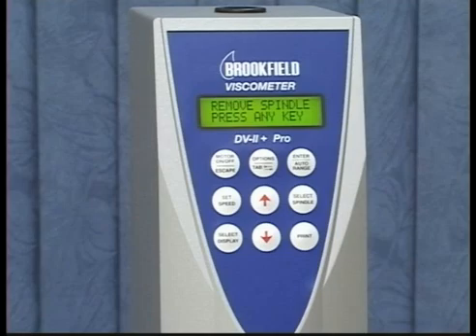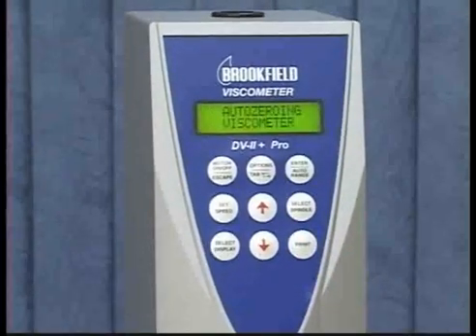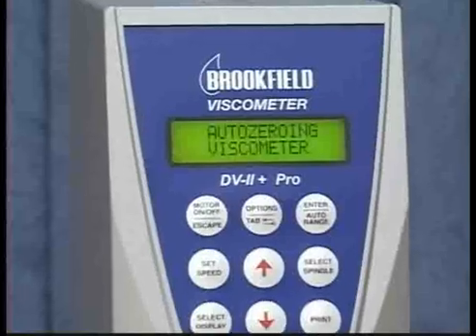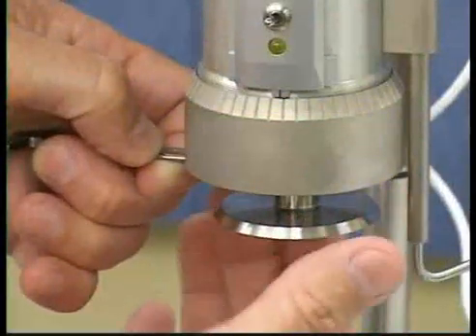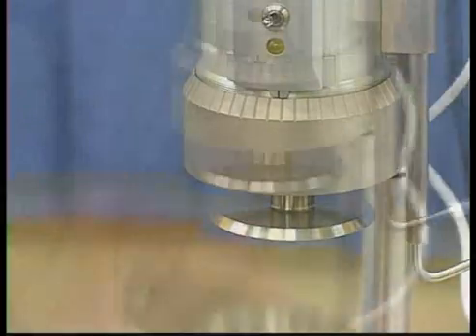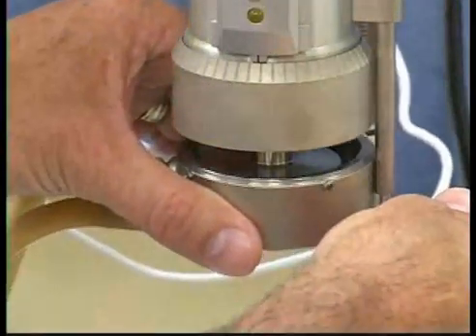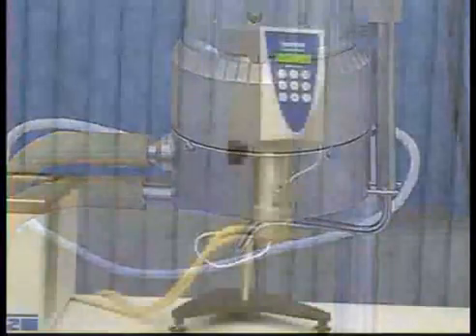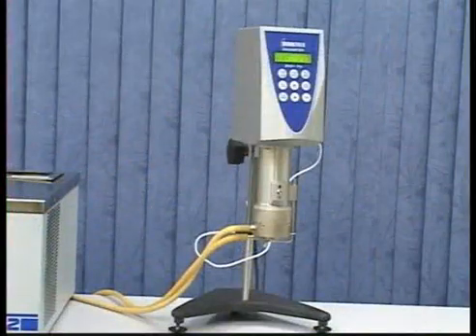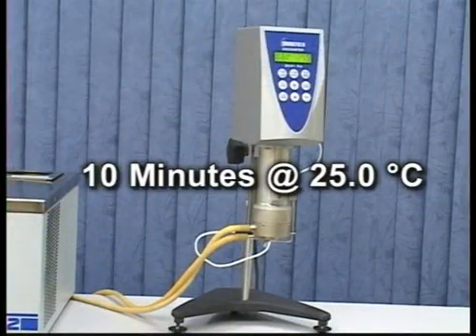Turn the instrument on and you will be prompted to remove the spindle and press any key. Once the auto-zero is completed, attach the spindle and the cup. To ensure a proper gap setting, allow the cup and spindle to equilibrate for 10 minutes at 25.0 degrees centigrade.